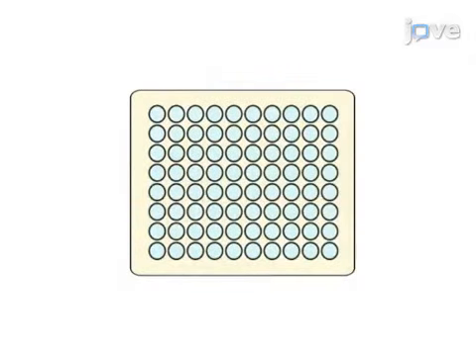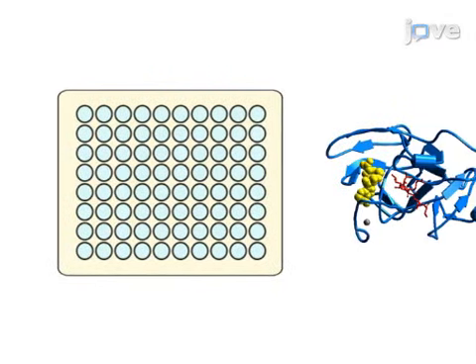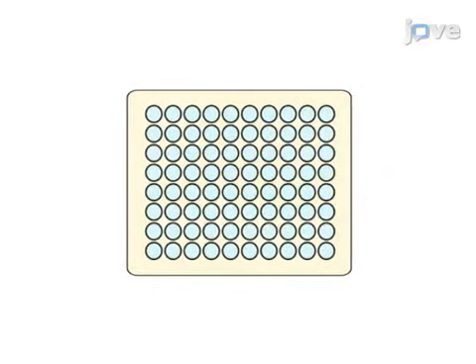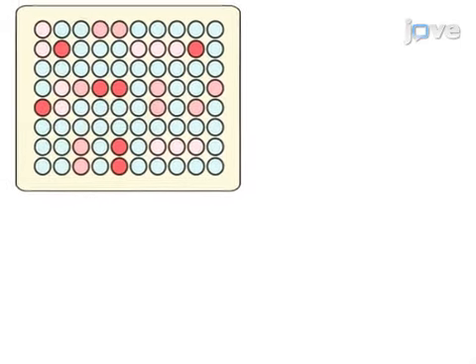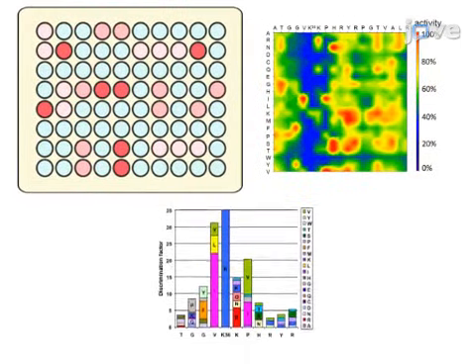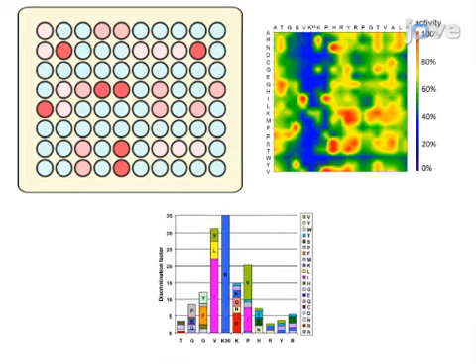As a second step, the peptide array is incubated with the PKMT in the presence of a radioactive methyl group donor, which allows detection of peptide methylation by transfer of radioactivity to the corresponding peptide spot. Next, the array is exposed to an X-ray film and quantitatively analyzed in order to determine the methylation activity at each of the peptides and to define the specificity profile of the PKMT. The results show which amino acids in the substrate peptide are critical for its methylation by the PKMT.